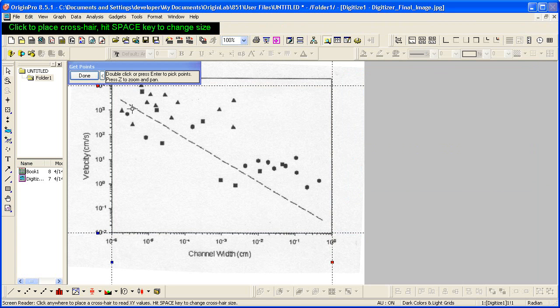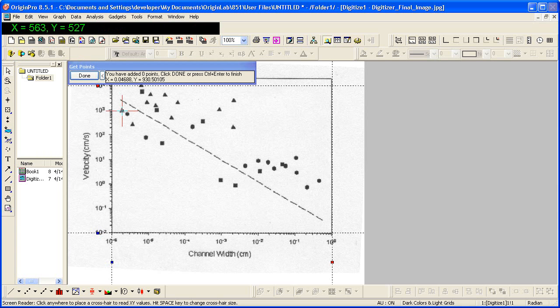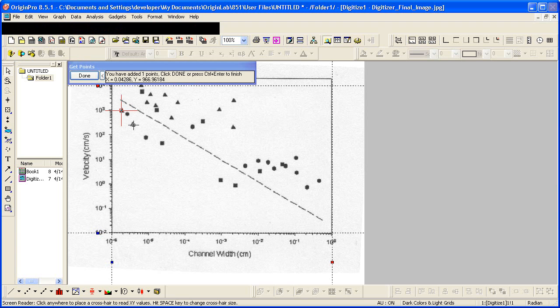And it allows me to select some points. I'm going to get the triangles here. So I click on a point. It shows me the values here. And I just need to double click or hit enter and then continue selecting points.